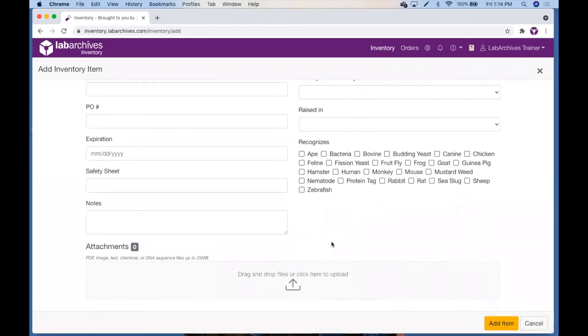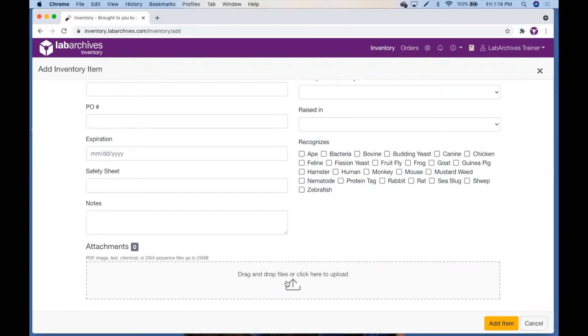If you have files containing supplemental information about this item, you can add them as an attachment. Drag and drop files or click here to upload. You can add PDF, image, text, chemical, and DNA sequence files. Please see our knowledge base for a full list of accepted file extensions.